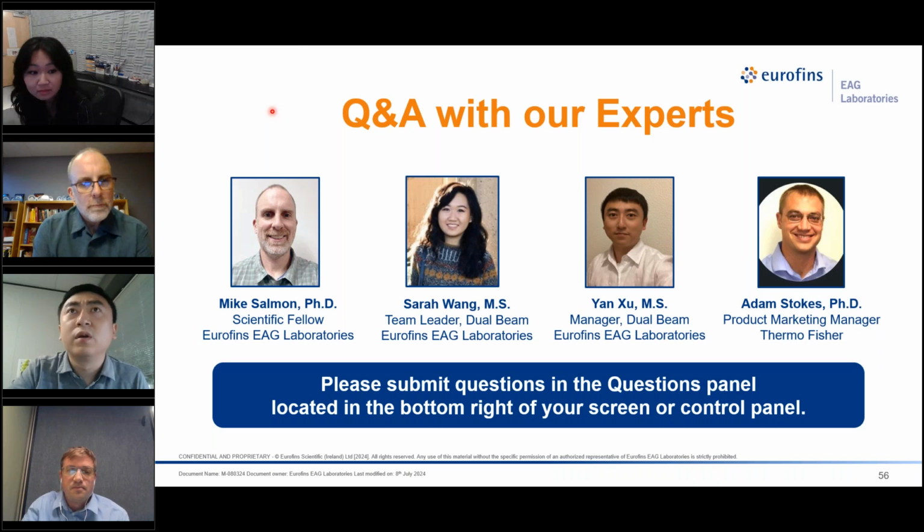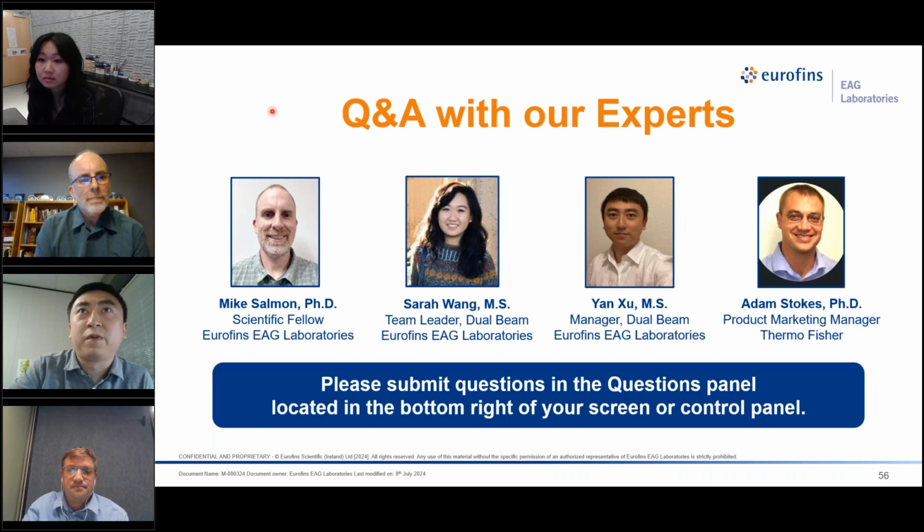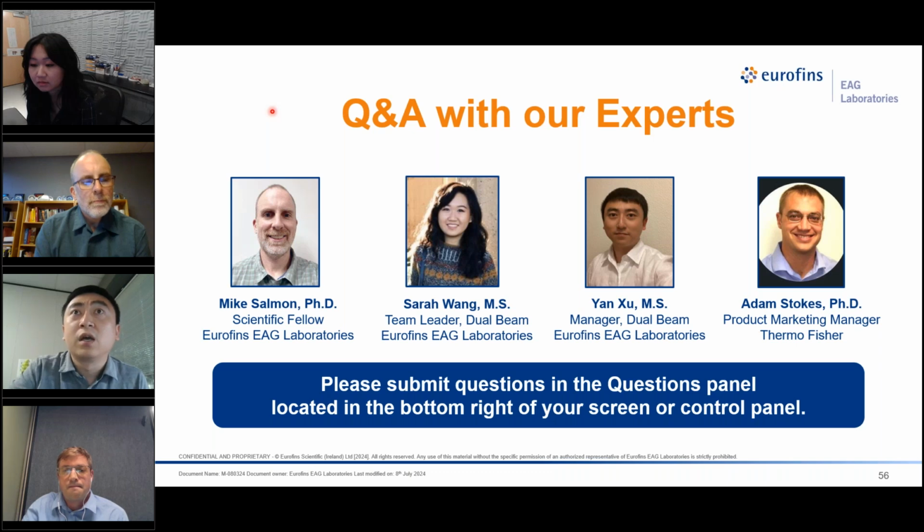Okay, great, thank you. And a client is asking, can PFIB do deposition? Yes, we can. And in our system, we have platinum, tungsten, and carbon.